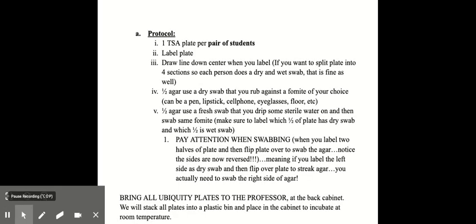So for the fomite test, you would have a TSA plate per pair of students. You'd label the plate, draw a line down the center when you label it because you're going to do a dry section and a wet swab of your fomite. So you would use half the agar to use a dry swab that you rub against a fomite of your choice. So you can use a pen, lipstick, cell phone, eyeglasses, the floor, any fomite that you choose. And then the other half of the agar, you'd use a fresh swab that you dip in some sterile water and then swab the fomite again with the wet swab.